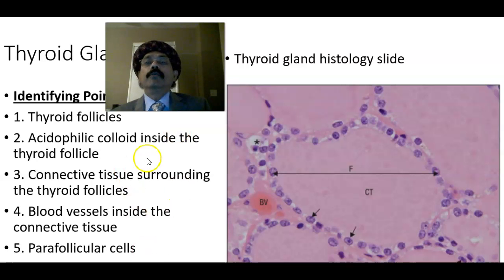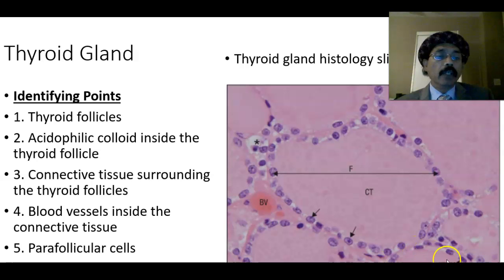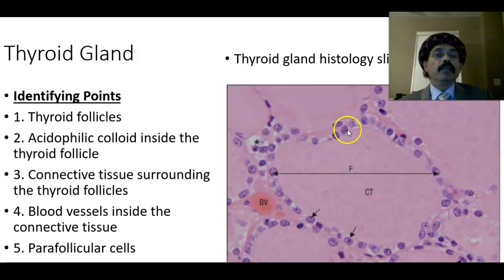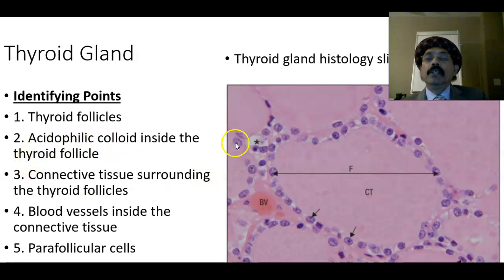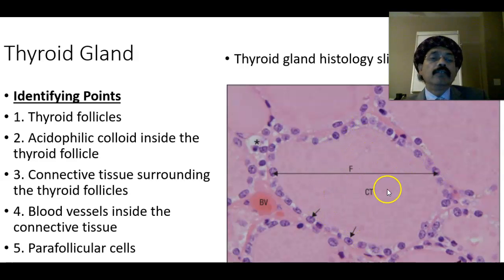Hello, today I will discuss the histology of the thyroid gland. The identifying points we have are thyroid follicles — here are the thyroid follicles, one follicle, another follicle. Thyroid follicles are lined by simple cuboidal epithelium in a normal euthyroid person. The follicle contains colloid, which is rich in thyroglobulin.